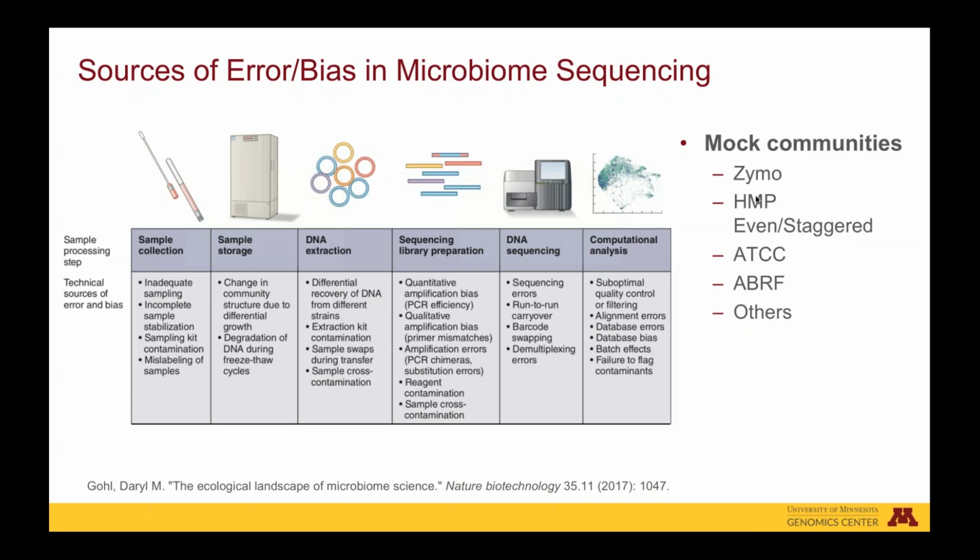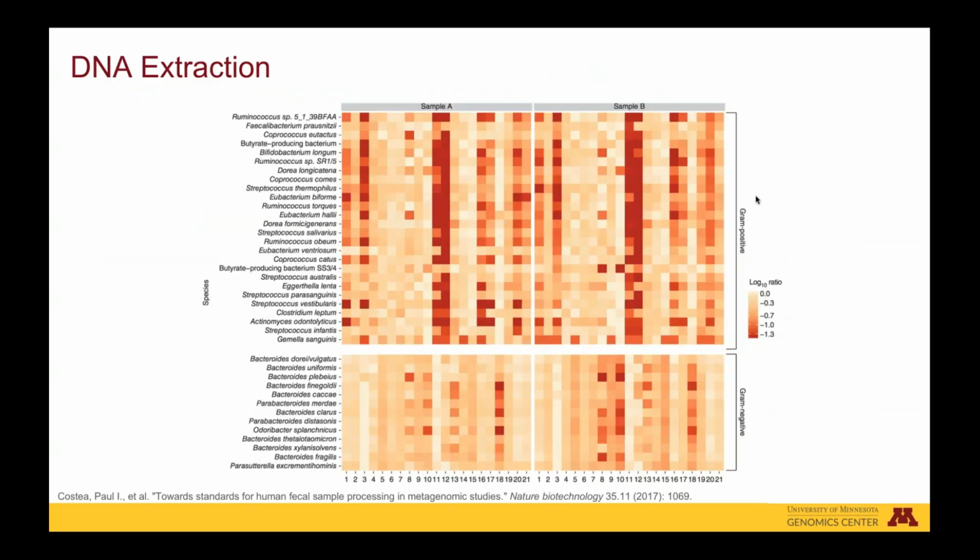In response to this, several synthetic standards have also been developed, which can be distinguished from natural sequences, and thus can be spiked directly into a sample. However, these samples being only synthetic molecular constructs don't account for a critical aspect of the process, which is DNA extraction. And indeed, it's been shown that extraction remains a significant source of bias.